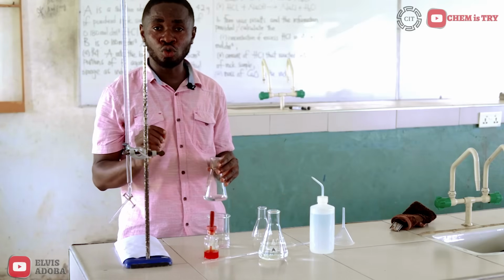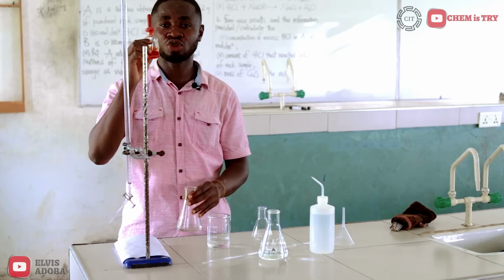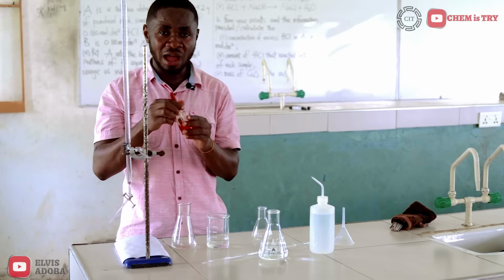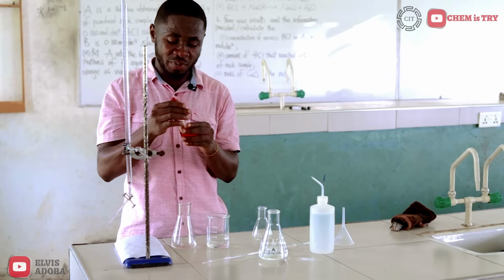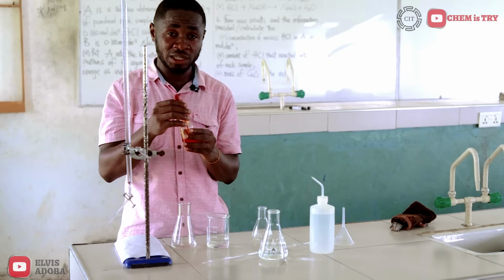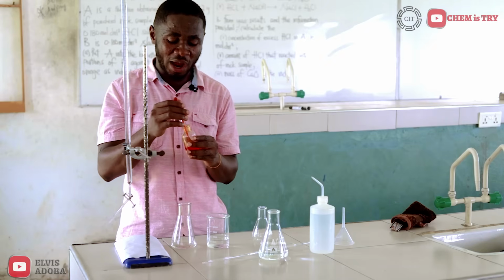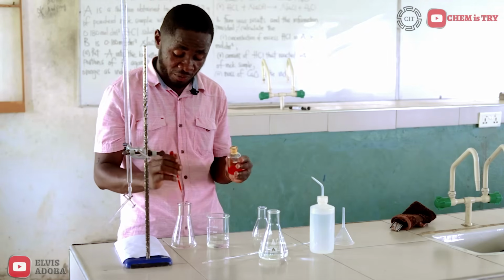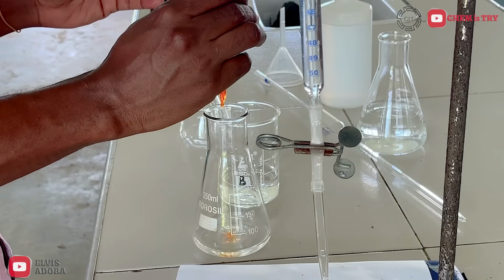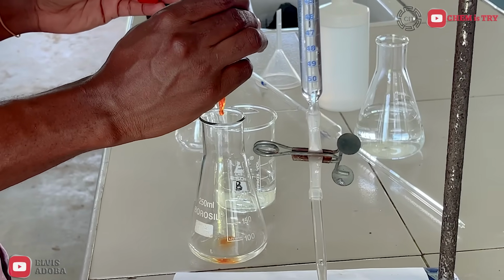Then I add 2 to 3 drops of my indicator. You know, these indicators are organic acids and organic bases. So it's appropriate to add 2 or 3 drops only, no more, because the more you add, the more you cause interferences in our titration. And that could affect our titer value.